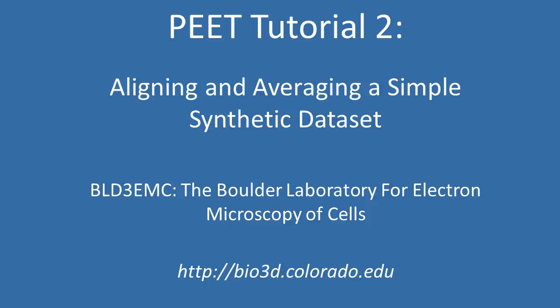In this second PEET tutorial, we'll look at aligning and averaging sub-volumes from a simple synthetic dataset.